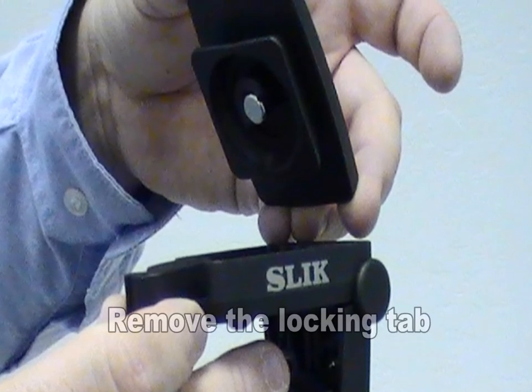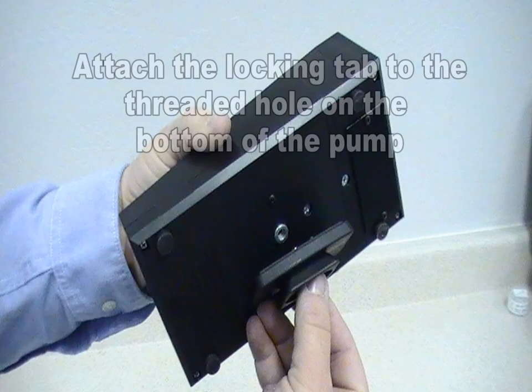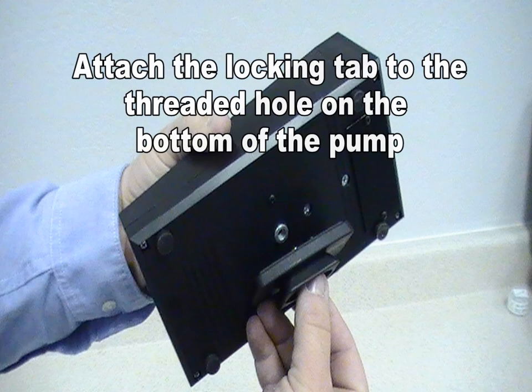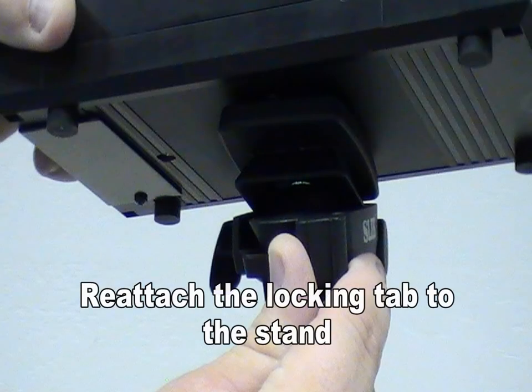The Biopump Plus can also be mounted atop an optional sampling stand available from EMSL Analytical. To use the stand, simply remove the locking tab from the top of the stand and attach the locking tab to the threaded hole in the bottom of the Biopump. Reattach the locking tab to the sampling stand and adjust the stand to the desired height.